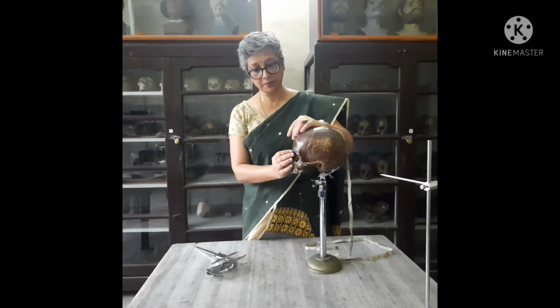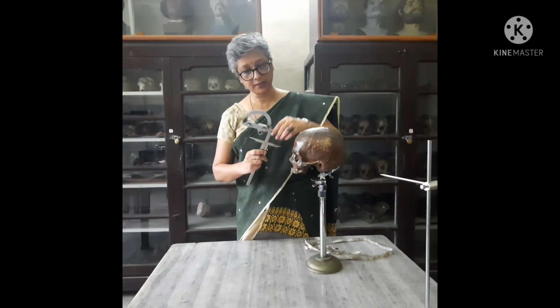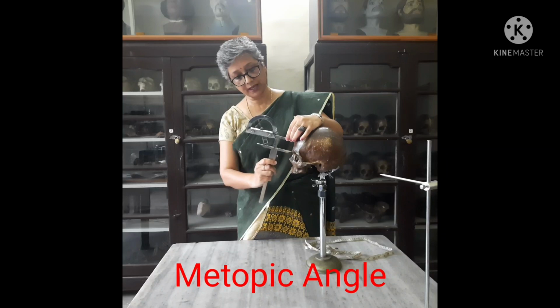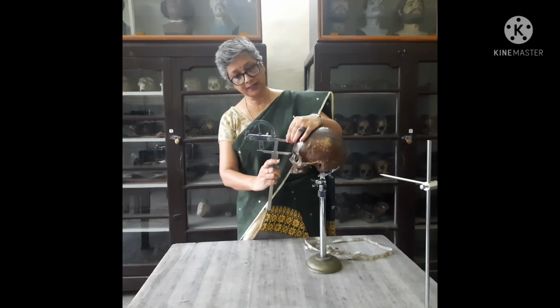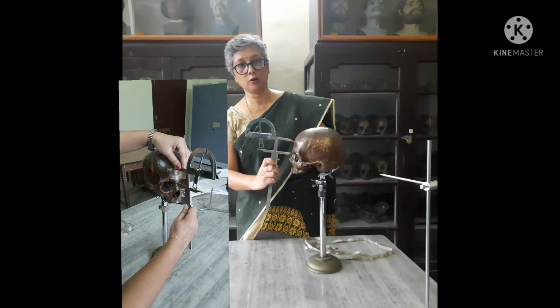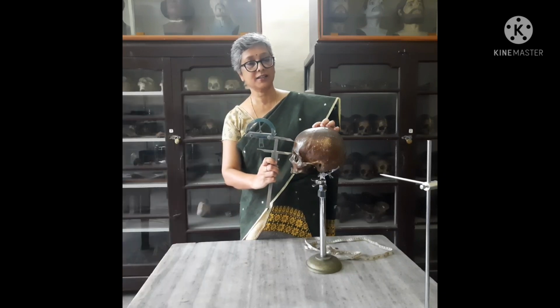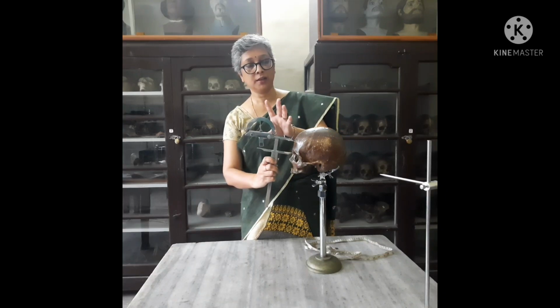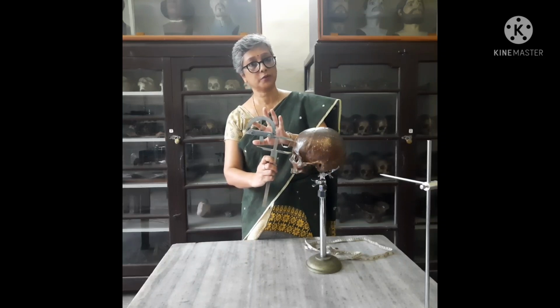The metopic angle is calculated as the straight line joining the metopion and the nasion, and this line will form an angle with the FH plane on which the skull is already oriented. The movable needle of the goniometer will indicate the angle, and this can be read from the readings on the protractor.